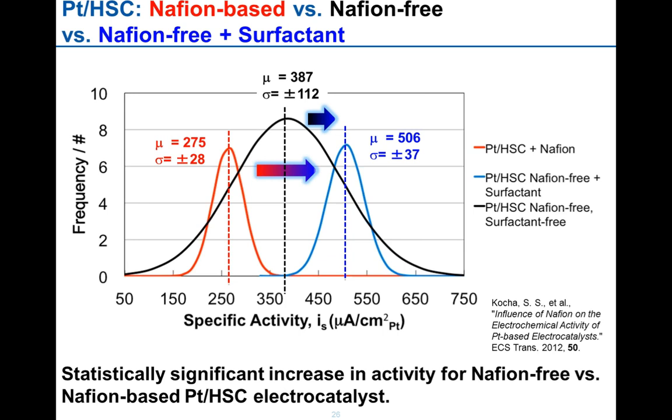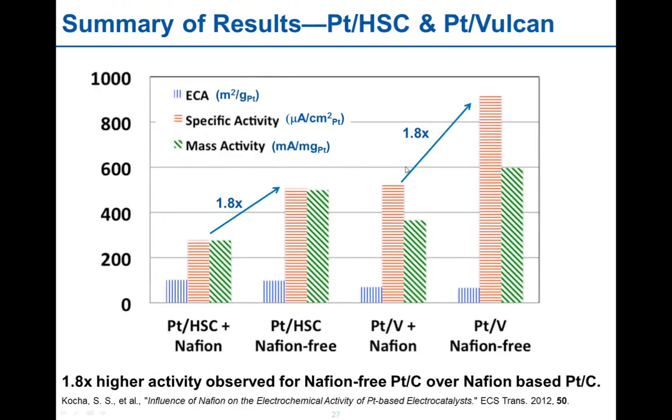We kept reducing the amount of surfactant until we used just about 2 microliters of surfactant. That gave us a reasonable dispersion and also a reasonably good-looking film. It still wasn't a perfect film, but the data was now much better, less scattered, and a much narrower distribution of values.